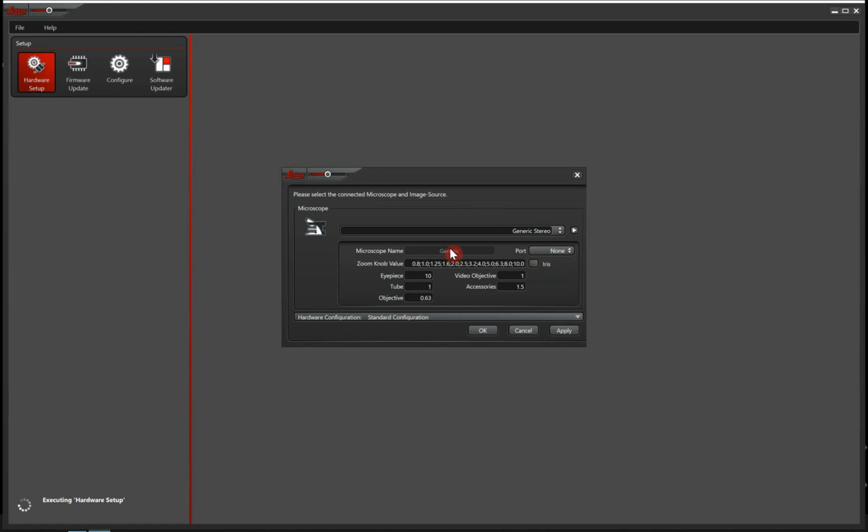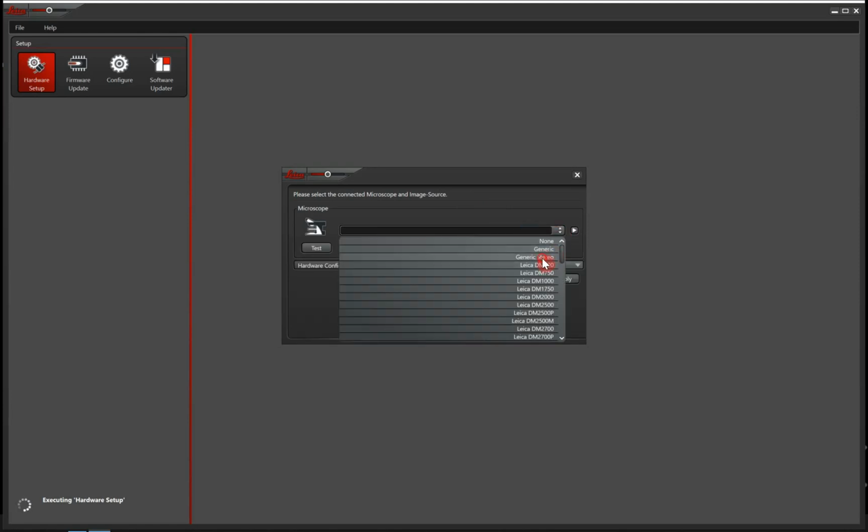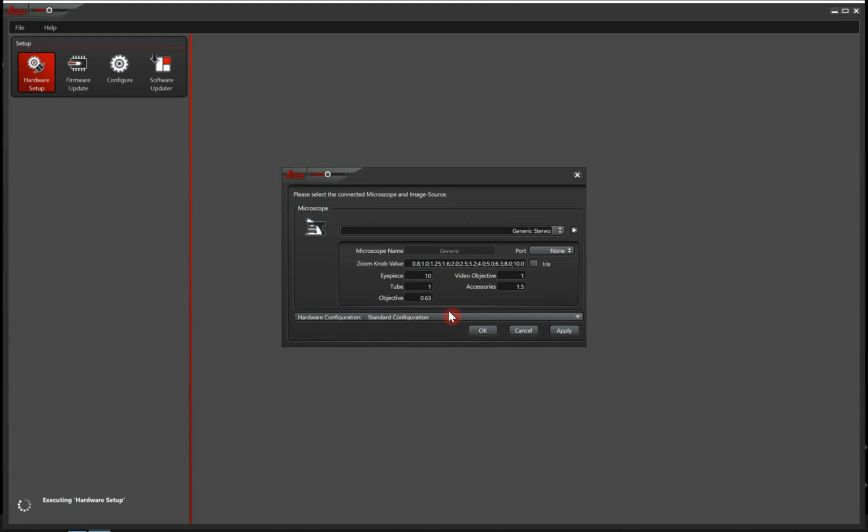And once you've done this, I can do like this just to show you. You will see that the values pop up here. And these are magnification values, and these are only important to get right if you intend to include scale bars or are performing measurements, or if you in the future want to know what magnification you used for acquiring your images. Otherwise, you will still get an image, but the magnification and therefore also measurements will be incorrect.